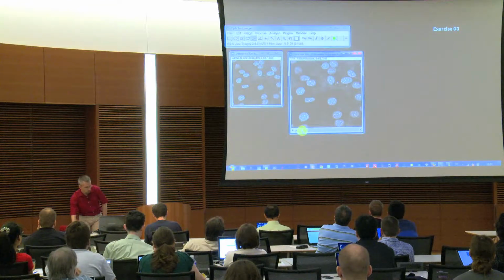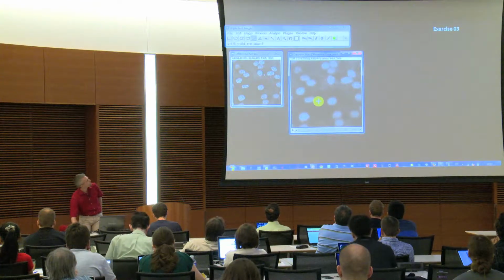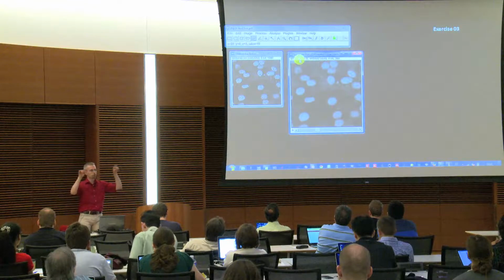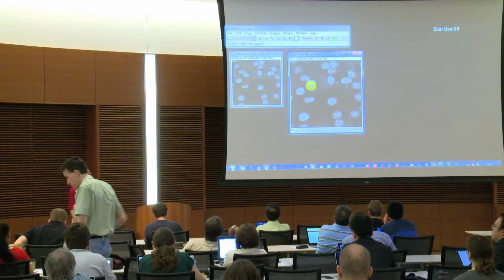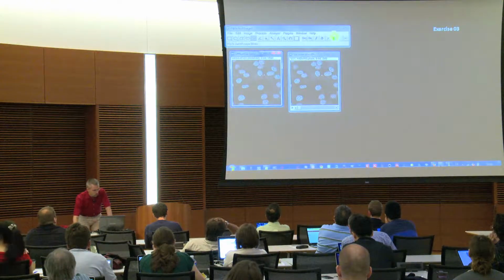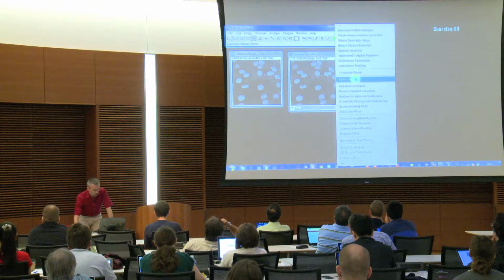And you see if you go through that stack here with the mouse wheel or the slider that you have, this increasing filter options. And this is actually indicated up here. So the radius, you see which radius is this slide which is shown and which parameter was used in addition. So we can do 3 other filters here. So we go back to the original, then to the filter check.